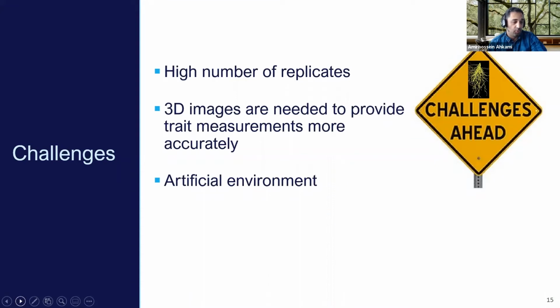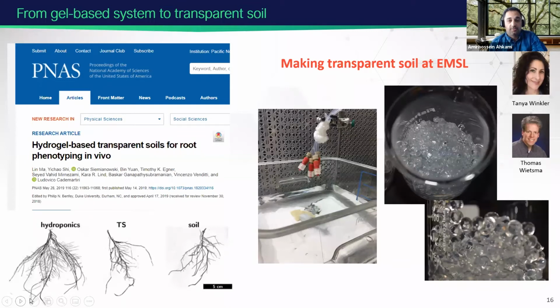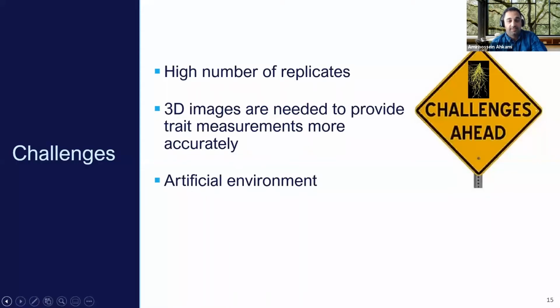So we work with other computational scientists to implement an algorithm that generates 3D reconstructions from rotational image series that we take with NARI. The other challenge with this system is that it is an artificial environment anyway, and it's hard to mimic the real environment.